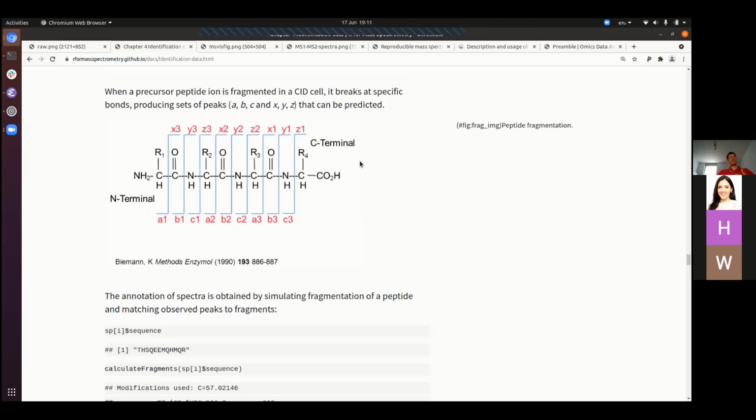And that would generate one bit that contains only residue 1, and then the rest of the peptide, the C-terminal side of the peptide that contains residue 2, 3, or 4. Another peptide, because we are analyzing thousands of peptides here, this one peak is not a single peptide. It's many copies of that peptide. Another one might break between residue 2 and residue 3, right here.